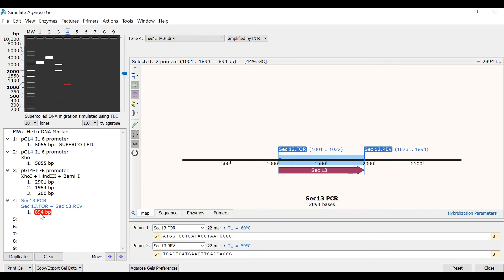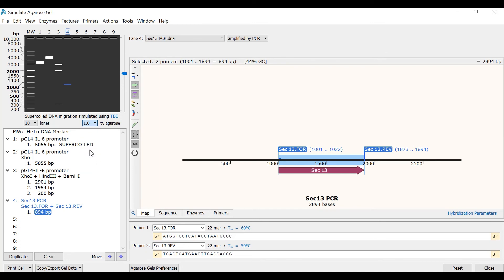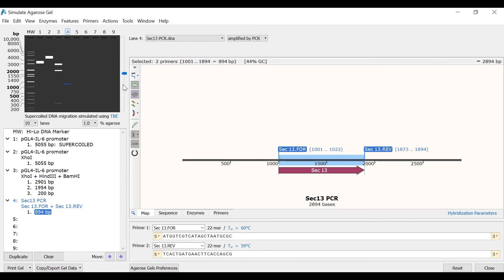Other aspects of the simulated agarose gel that you can adjust are the gel concentration and the running time. By using the dropdown menu, you can change the agarose percentage of the gel, ranging from 0.5% to 4%. Additionally, by using the slider to the right of the gel, you can change the simulated running time. Sliding the bar up will shorten the running time and sliding the bar down will lengthen it.